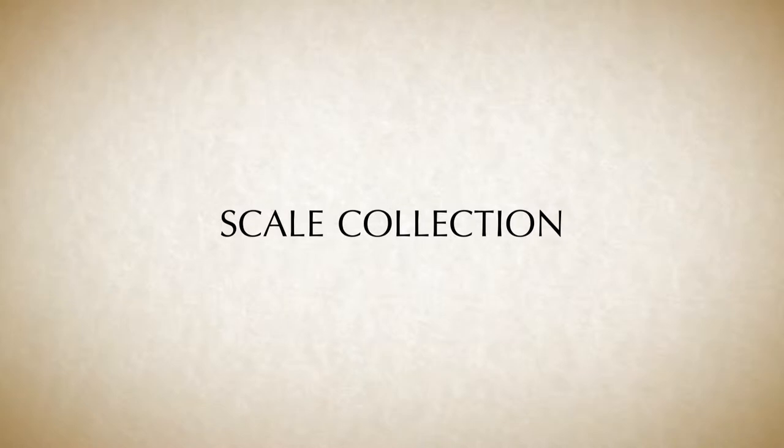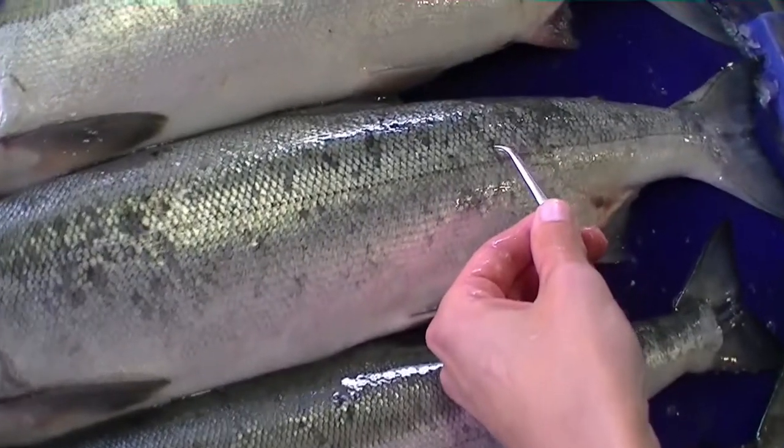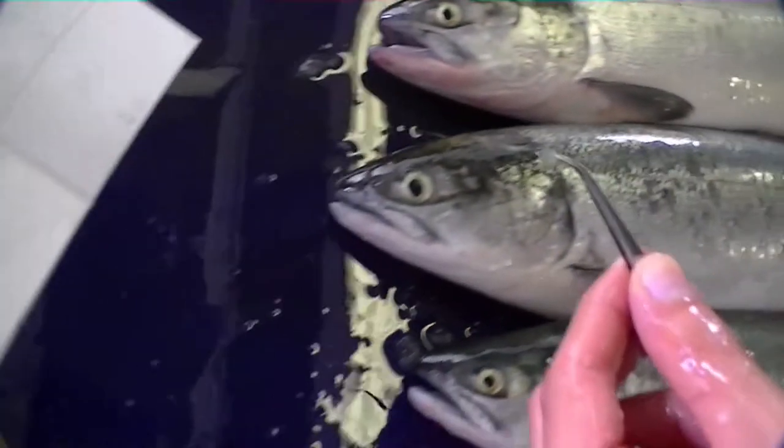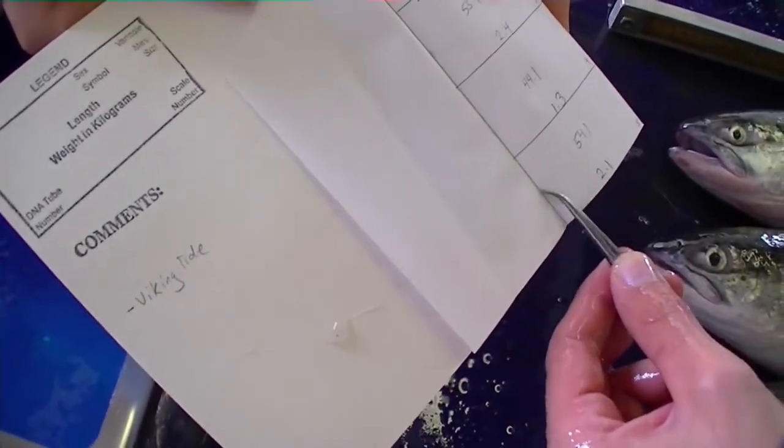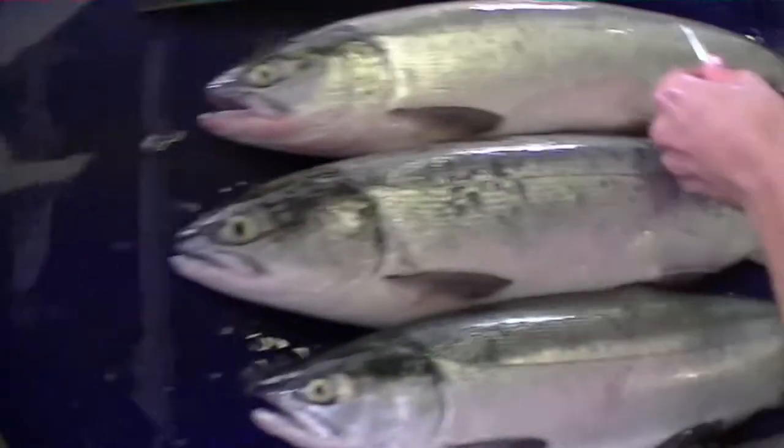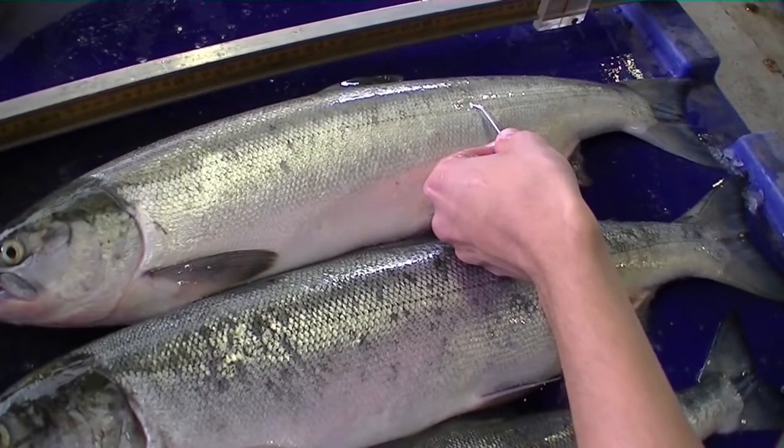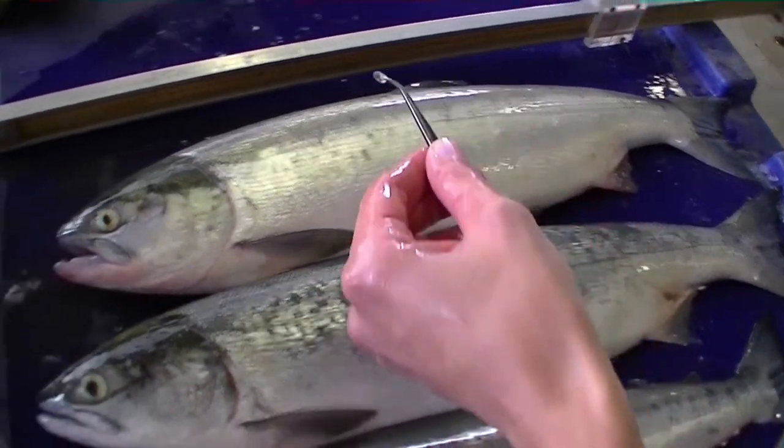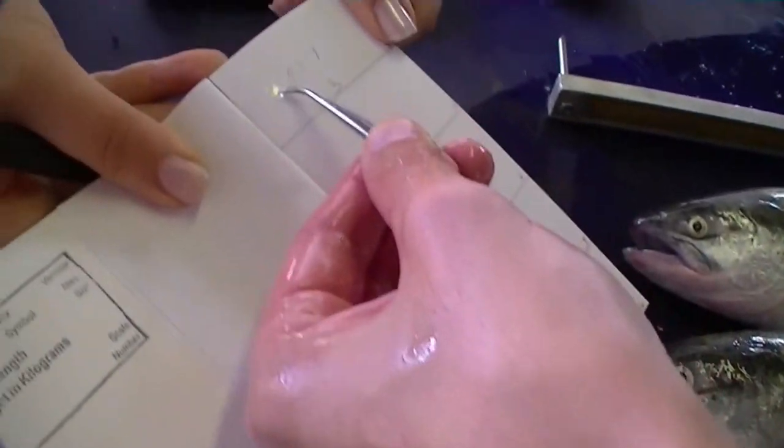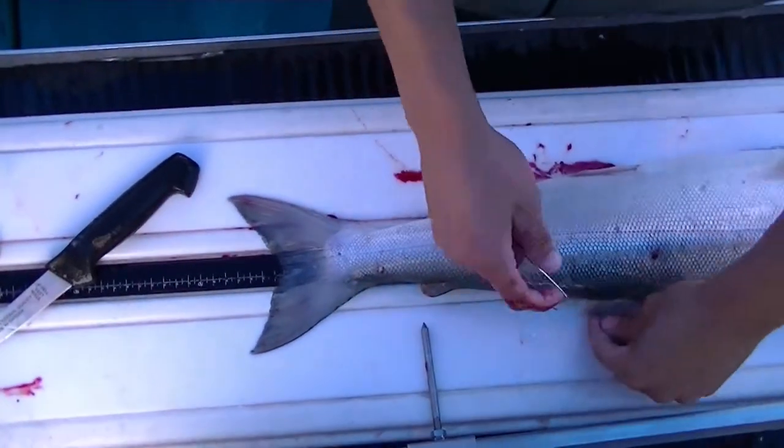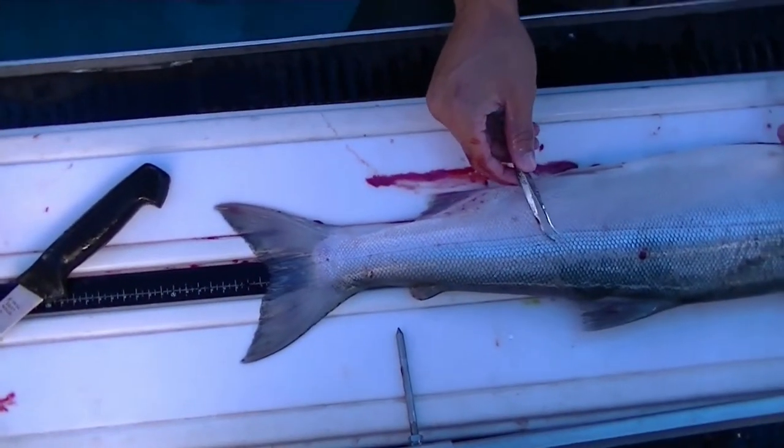Let's move on to the collection of a scale sample. A single scale should be collected from each salmon using a set of forceps. Ideally, the preferred scale should be collected, which is the scale located on the left side of the salmon, two scale rows above the lateral line, and along a diagonal line from the back of the dorsal fin to the front of the anal fin. You can see how the sampler traces this location using the forceps prior to collecting the scale.